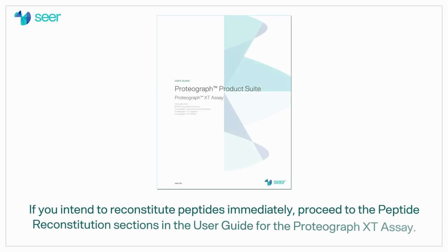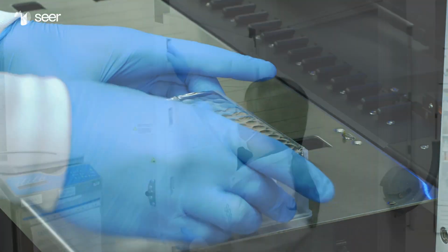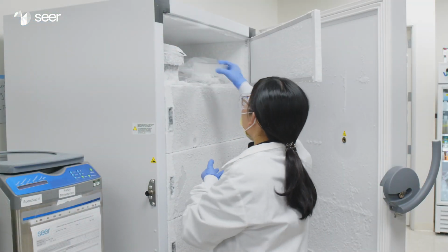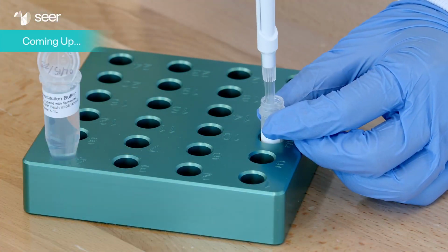If you intend to reconstitute peptides immediately, proceed to the peptide reconstitution sections in the user guide for the Proteograph XT assay. If you are reconstituting later, seal the collection plate and store at -80°C for no longer than 1 year. We've finished peptide quantification and dry down. Next, we'll proceed to peptide reconstitution.